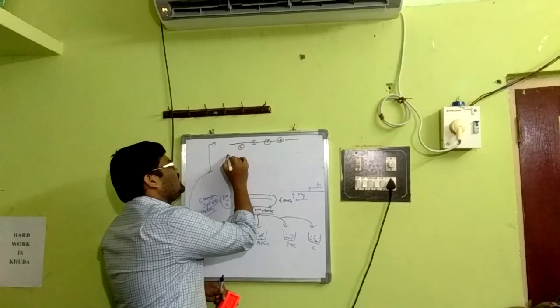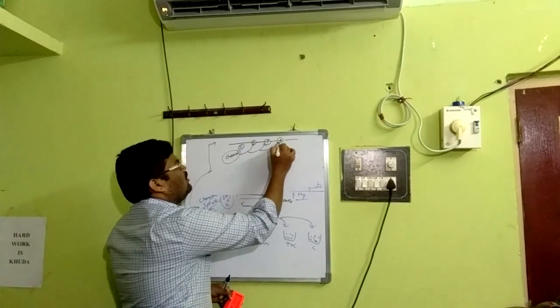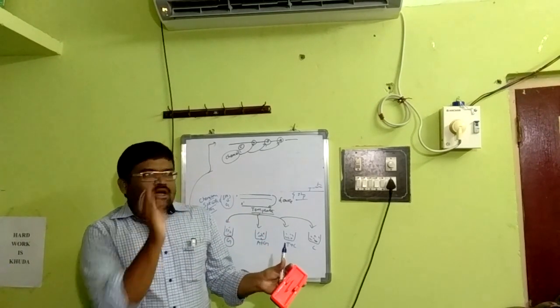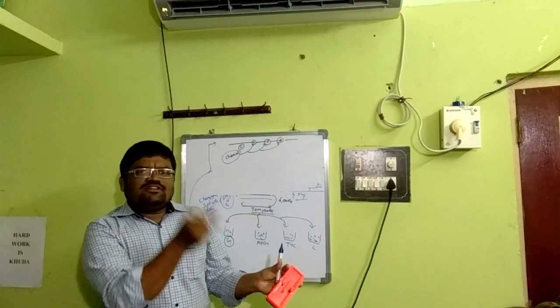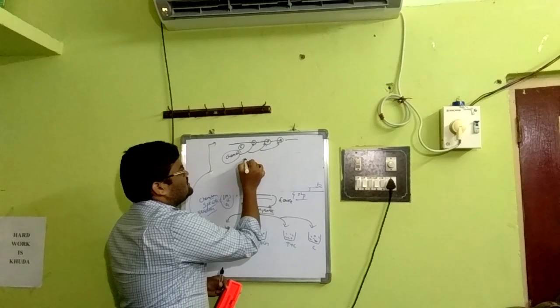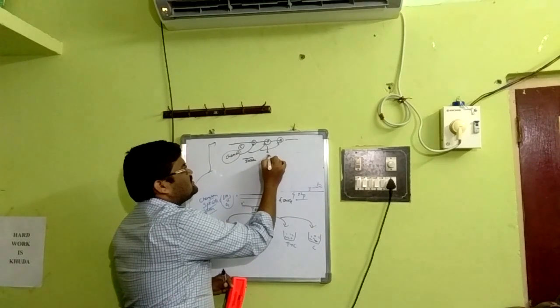A particular chemical specific to C acts at 4, 7 or 10. That means there are possibilities of different combinations. Assume a strand with a C residue at the 4th position, or a strand with a C residue at the 7th position, or a strand with a C residue at the 10th position, and it leads to different lengths. For example, if it breaks here, it leads to 3 bases, that means a tiny fragment of 3 bases. Here, 6 bases.